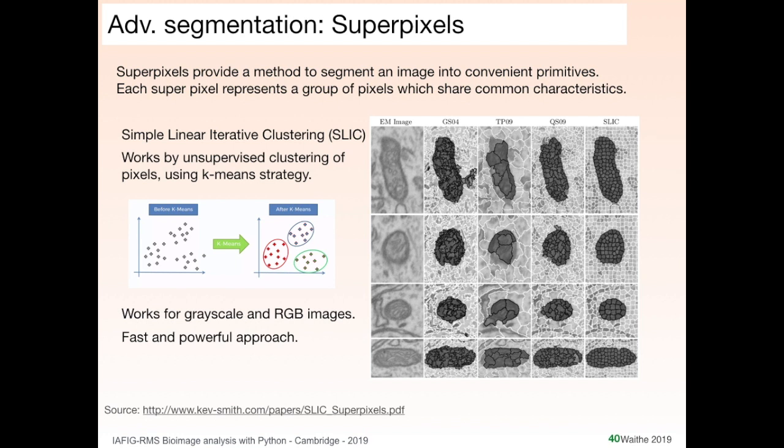what we call superpixels, and from here we can then make measurements in each chunk and potentially merge them together or do some kind of analysis on those individual chunks. And these are great fun to apply to photography images as well, and to biological images. It's just a really nice way of breaking your image up into nice sized areas. It generally requires some processing subsequently to do things with those chunks, like merge them together. But it works surprisingly well at separating background from foreground, and also different parts of a cell from one another.